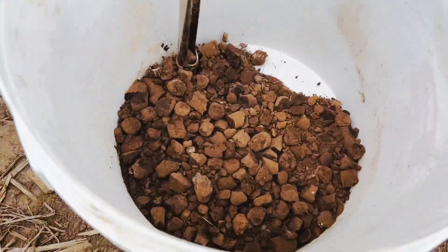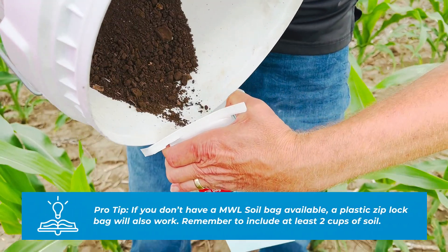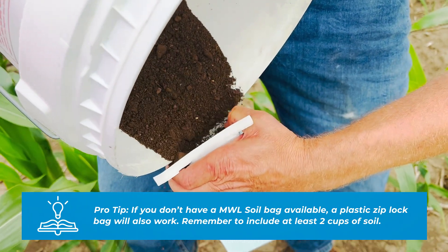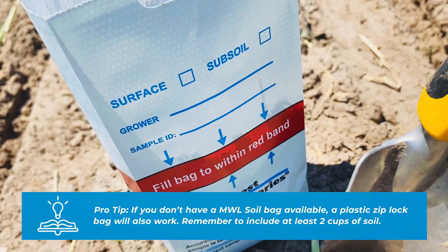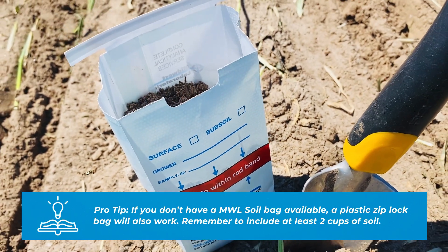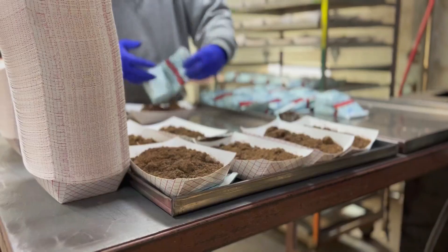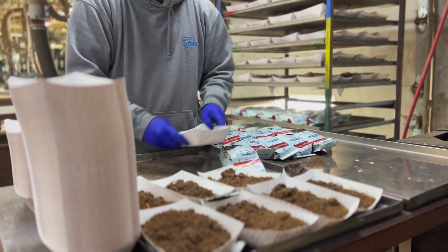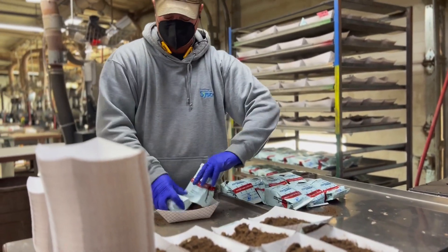Another key factor in the success of taking proper soil samples is making sure that enough sample is taken to fill the Midwest Lab soil bag to the red line. This ensures enough sample is taken to run all the required testing, to perform any reruns, or to add on additional testing. Following these simple steps will help make sure a proper sample is taken and the best results are produced.